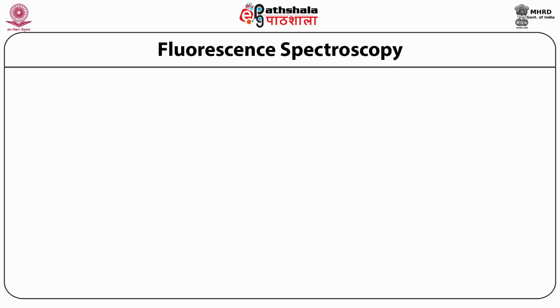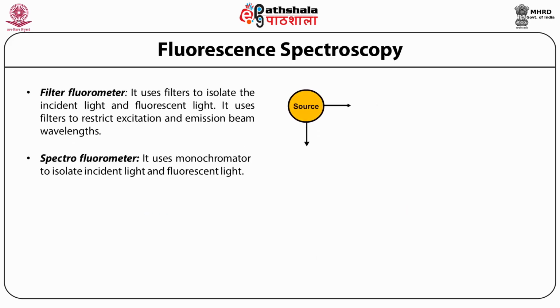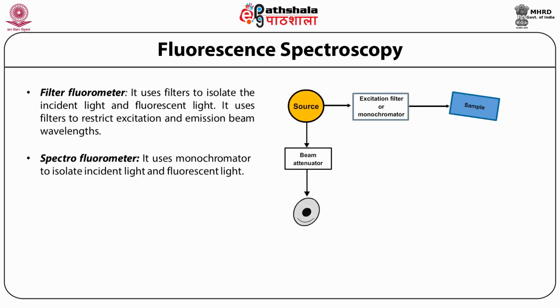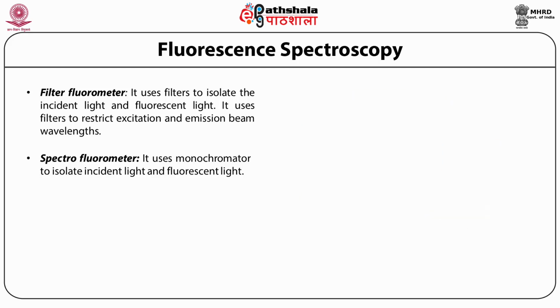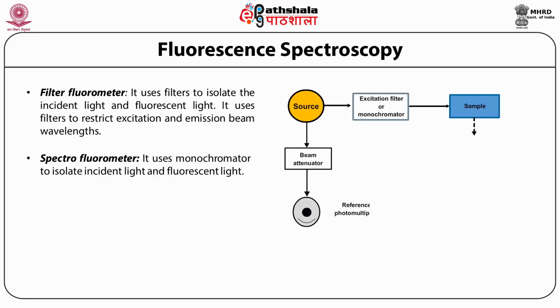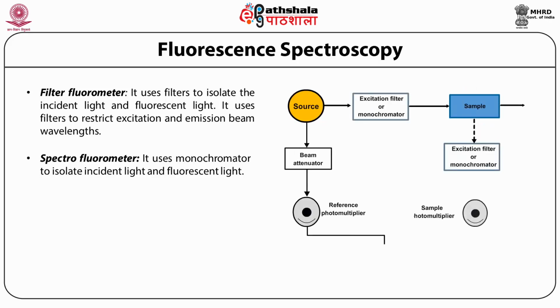Fluorometer. Fluorescence spectrometers provide a tool for analyzing the spectral distribution of the emitted light from the sample. The fluorescence emission spectrum includes either a continuously variable interference filter or a monochromator.